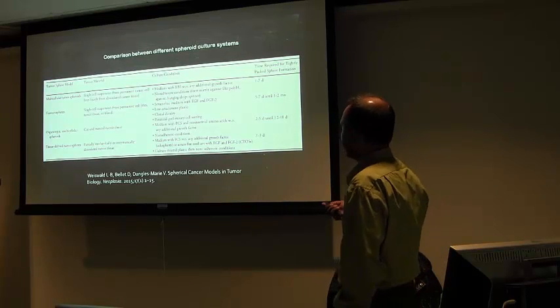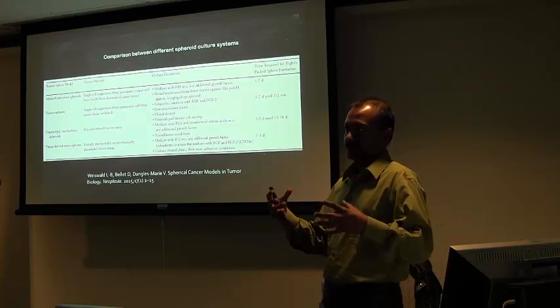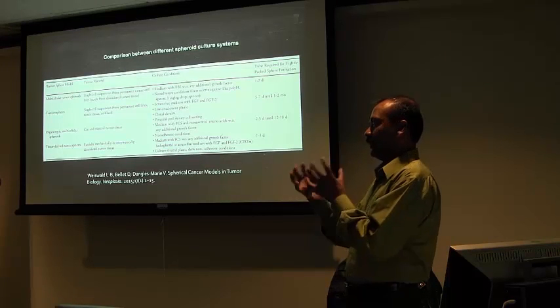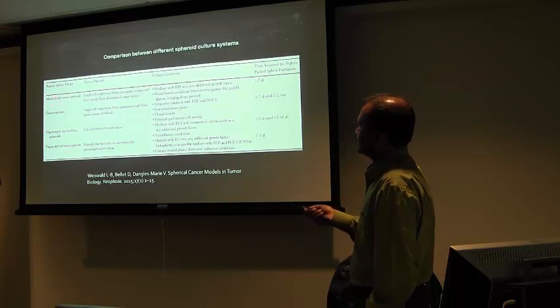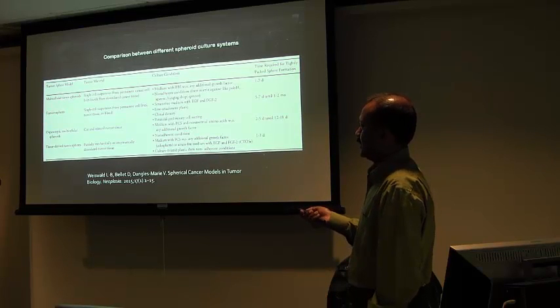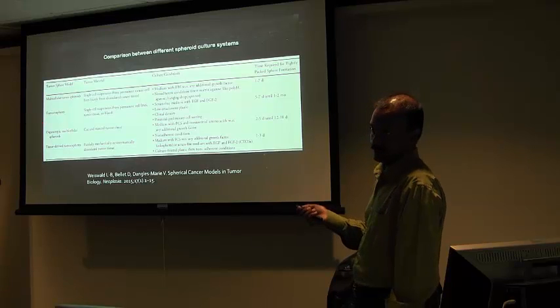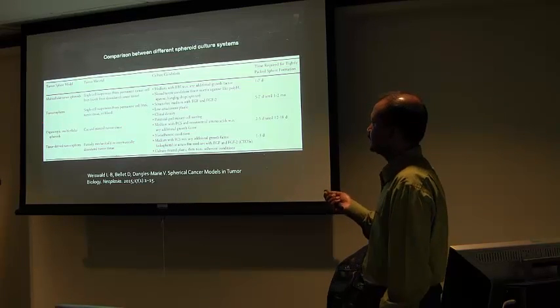I'll discuss that one a little bit. Then you induce the cells to form an aggregate and form a multicellular spheroid. But this is different from tumor spheres. My research actually includes making tumor spheres, so I'll bring one example from my research to describe this.